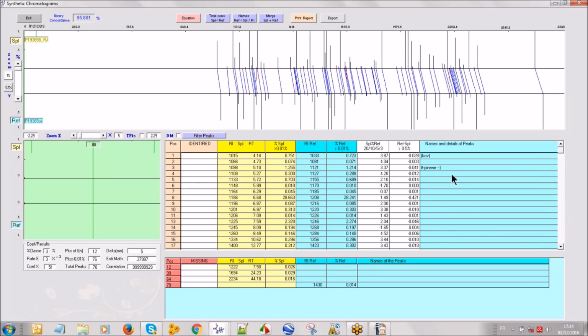But here, as you know, usually it takes hours to identify the molecules by the mass, then check all raw materials that have this molecule. Here we have just done it in less than a minute. When you are used to it, it's very fast.